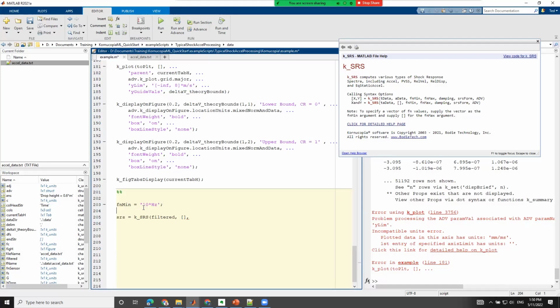And the maximum will enter into the function itself. And we'll set the damping value to be 0.05, which is an often used default damping value. So then we're specifying it's filtered. We're going to go for the minimum. And then if we put this as a string, oops, not a variable.